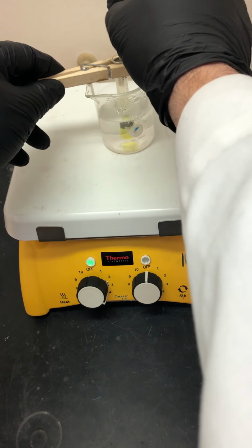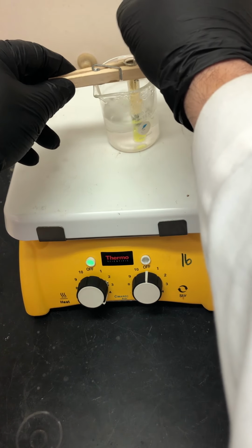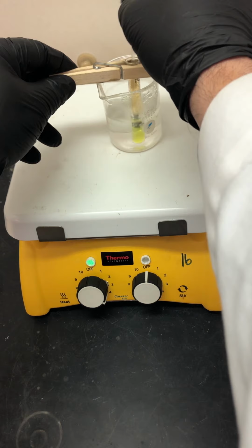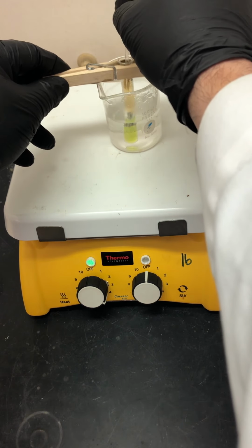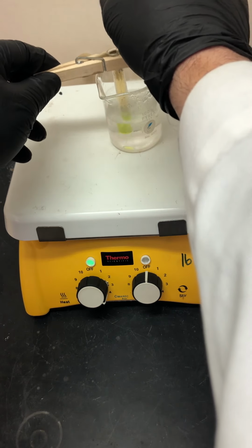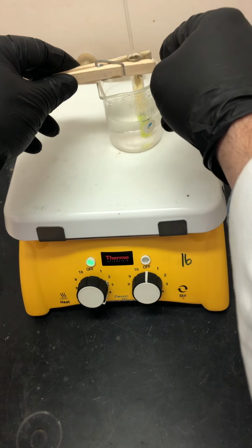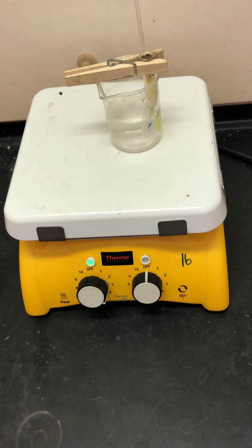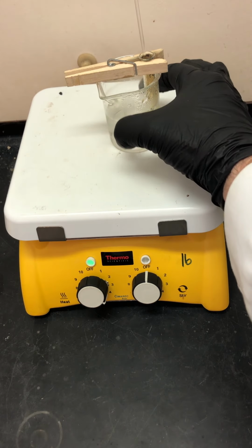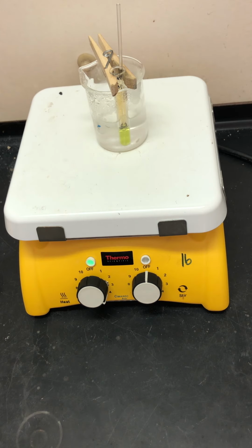As you can see, there's already a change in coloring. These are different colors that are going to be going through here. You're going to see it start turning into a little yellowish, then maybe a greenish. The yellow might be a little bit of leftover iron. So I'm going to let it sit there for a few more minutes, and let's see what happens. Let me spin this around so you can see. You can see that it's starting to develop a greenish to aqua blue kind of color as it dissolves. So let's leave it there for about 3 minutes.